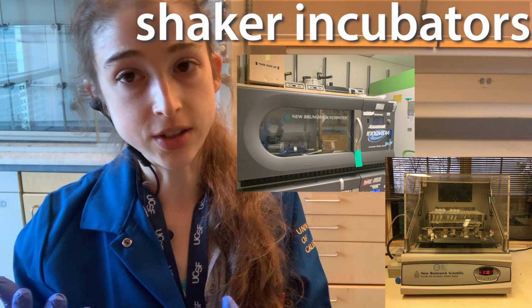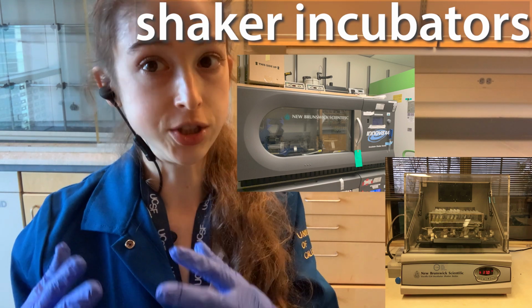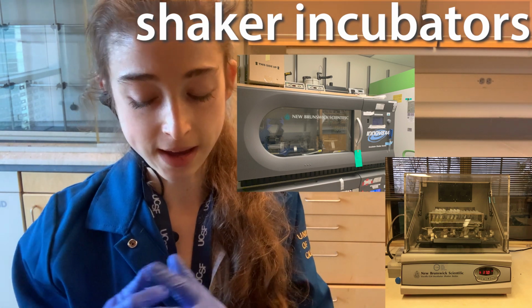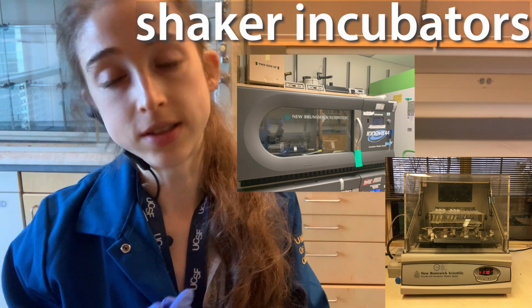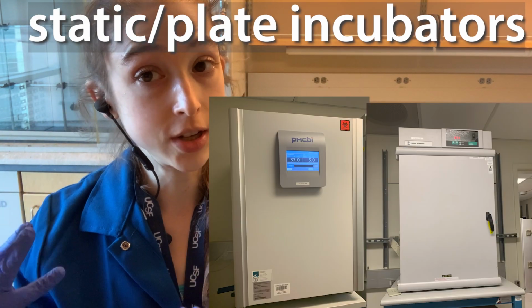Some of these also control the CO2 and the humidity, which you need when you're working with mammalian cells, which are pickier. They look similar, but these have this extra set of features.